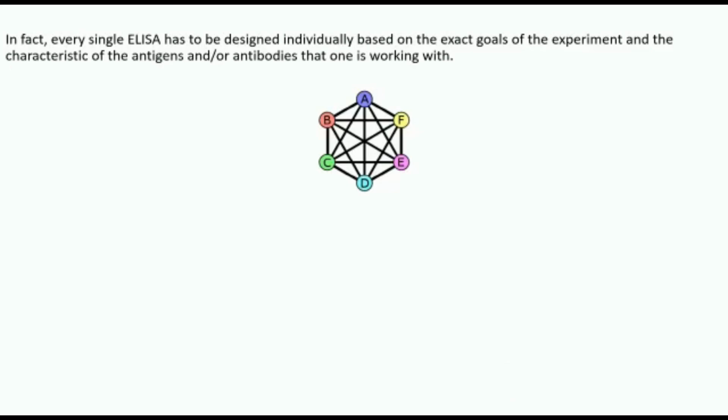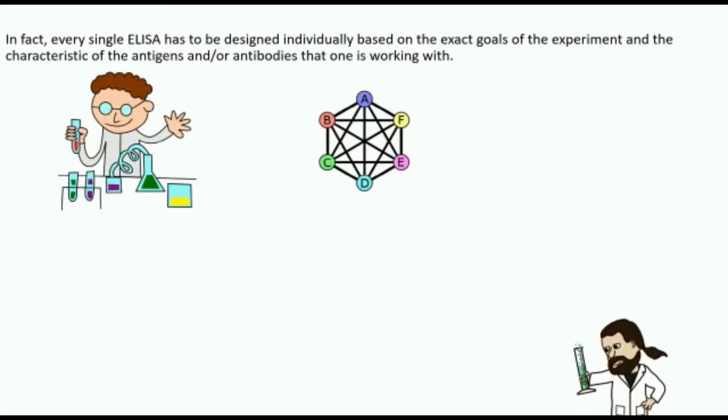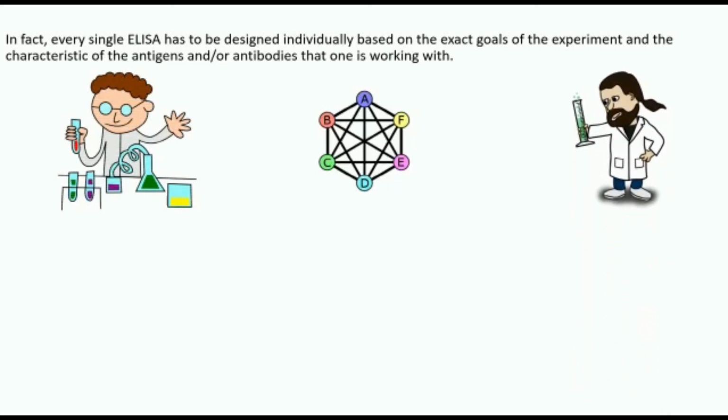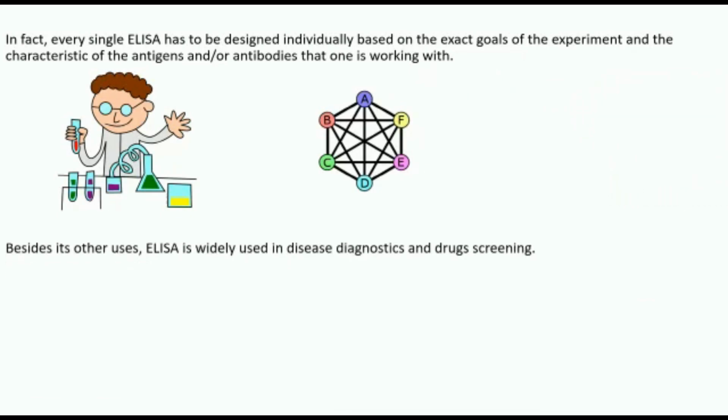In fact, every single ELISA has to be designed individually based on the exact goals of the experiment and the characteristics of the antigens and/or antibodies that one is working with. Besides its other uses, ELISA is widely used in disease diagnostics and drug screening.